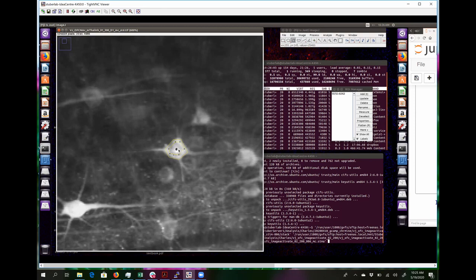One question here is, what's the minimum number of pixels you would want to include in an ROI, like 15 to 20? I'd say, yeah, 15 to 20. Okay, cool. So we'll do one example of something like that pretty soon.